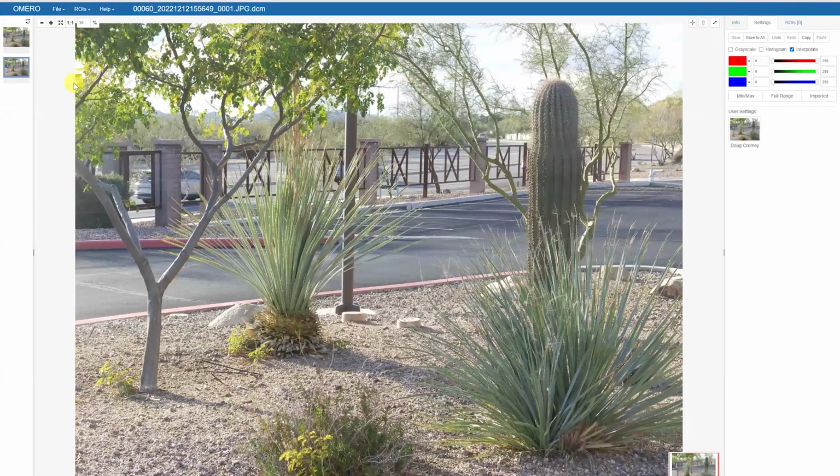And just to prove that it isn't just that kind of data, when we were working with the skin biopsy group, just so that we weren't moving a lot of patient-related images around, I said, just send me some pictures from the camera. So they took pictures in the parking lot. So this is a JPEG image that we uploaded.